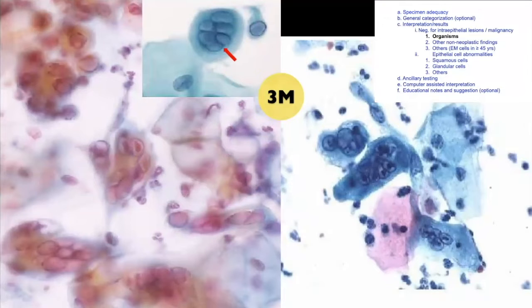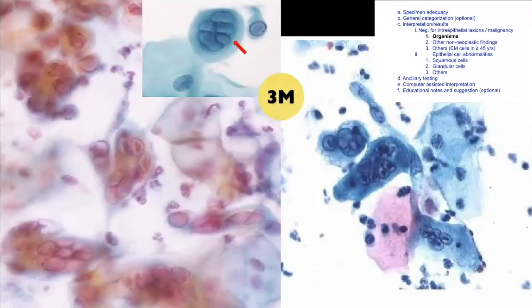Here is a characteristic epithelial abnormality showing multi-nucleation, molding, and margination of the chromatin to the nuclear membrane — the 3M rule: multi-nucleation, margination, and molding. This is very characteristic of Herpes simplex virus (HSV).